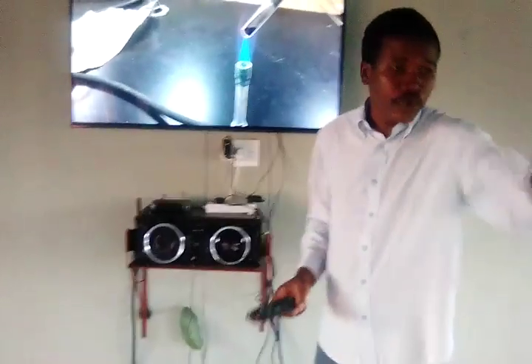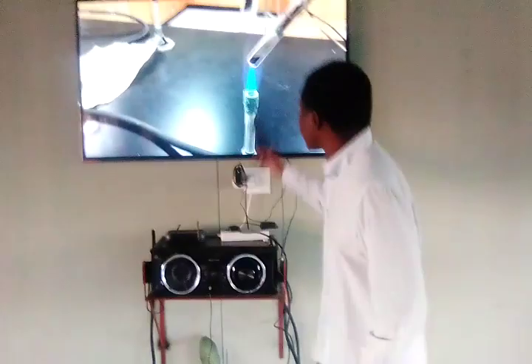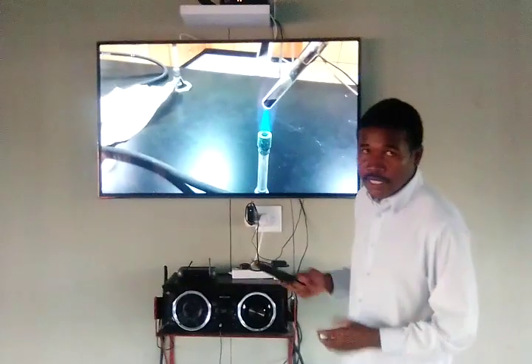You saw the color. You can rewind the video, you can go back and you can see the color. So write the initial color in your exercise. You will find that you have to write the initial color of what the copper carbonate was, and then the final color. I hope you'll be able to see this, right? So there we would end this particular experiment.